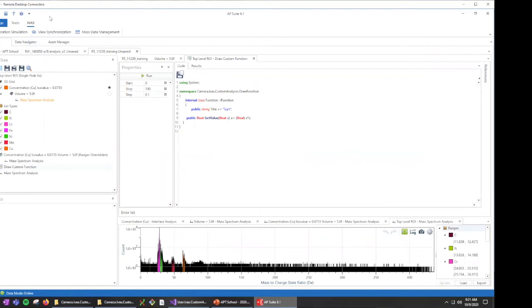And I talked about annual releases of APSuite. We hope to, and we're trying to figure out the best way, to have interim releases of just the modules inside. So if we have new features for IVAS, we don't have to wait a full year to give you updates.